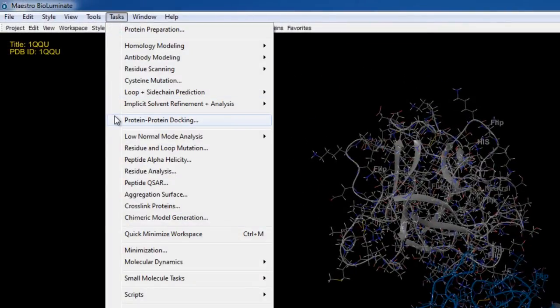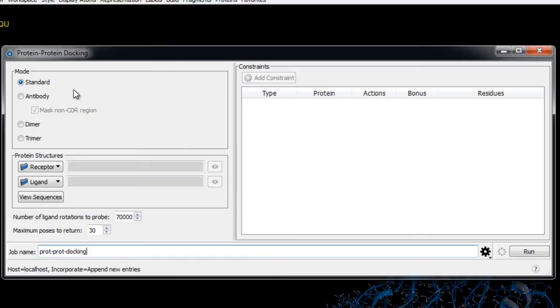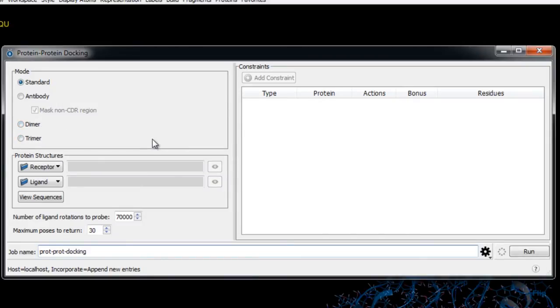With that in mind, let's go to Tasks > Protein-Protein Docking, which uses the Standard mode. This mode is used for docking a protein to another protein without any special conditions. If we were docking an antigen to an antibody we might want to add special conditions such as preventing docking to the non-CDR region, and if we wanted to dock a protein to itself to create a dimer or trimer we would use those options.